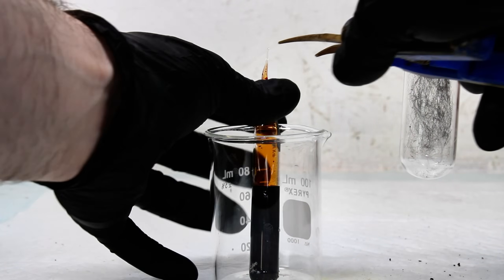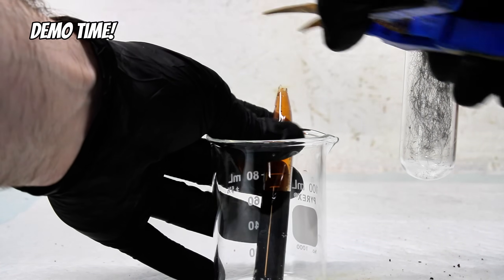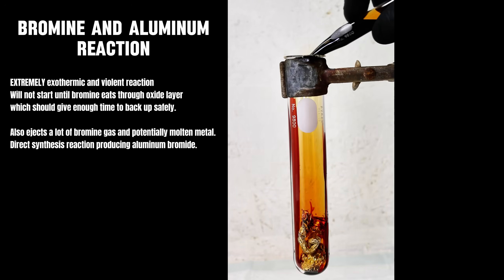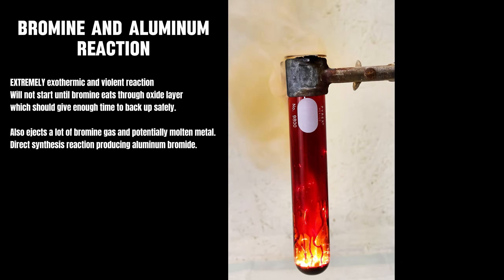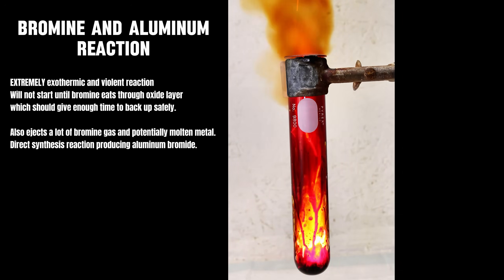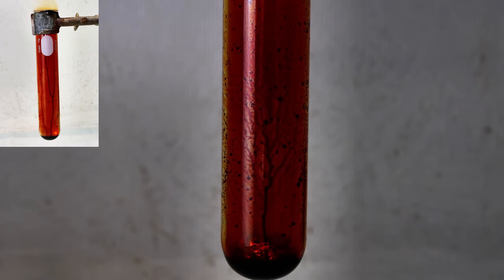I decided to sacrifice one of my bromine ampoules to demonstrate the reactivity of this element. One of the most famous reactions with bromine is with aluminum metal, which you can actually do fairly safely as it takes about 20 seconds for the bromine to eat through the outer layer of aluminum oxide. As soon as it does, though, the two violently react, generating white sparks of molten aluminum and the salt aluminum bromide. This first reaction was actually so violent that it shot about half of the aluminum out of the tube, so to finish the reaction up, I adjusted my camera and added another piece of aluminum.